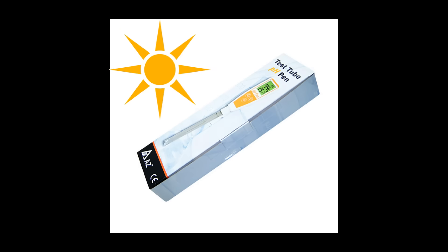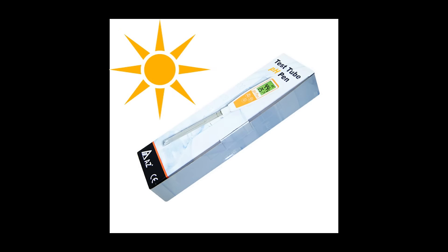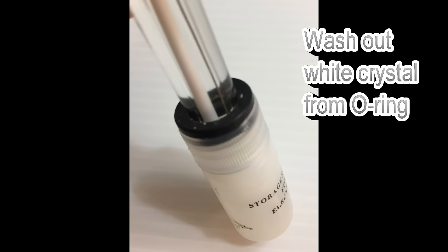Keep the PH pen in cool place and away from sun exposure to reduce storage buffer vapor. Having white crystal around the bottle O-Ring is normal. Simply wash clean to keep O-Ring in good shape for a long-term use.